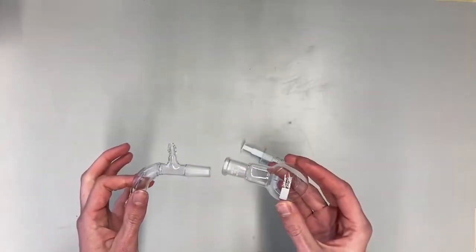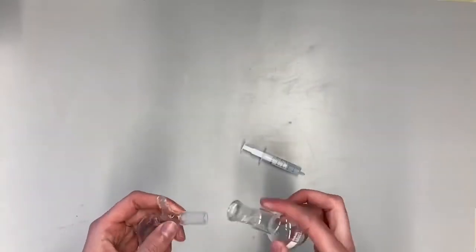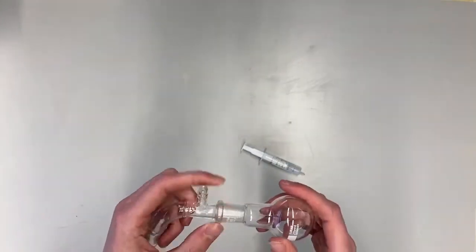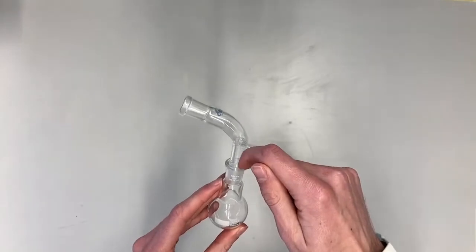If you want to connect a male joint and a female joint without greasing, you will hear that it makes noise, and sometimes it will even be so stuck that you can't get them apart from each other anymore. And when doing things on the vacuum, air will leak through the joint.